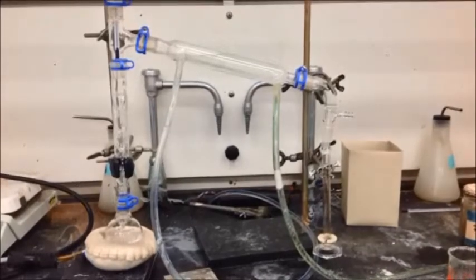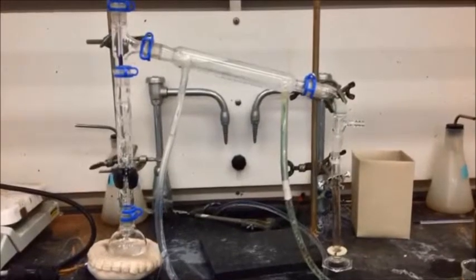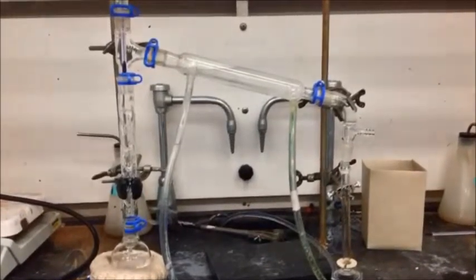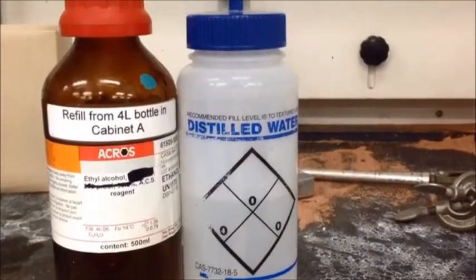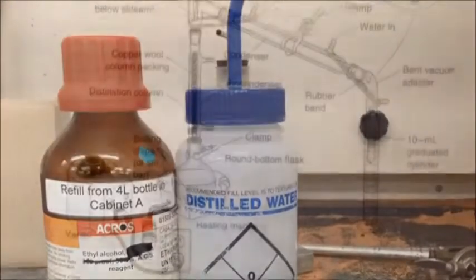Fractional distillation is a method of separation using boiling points. The substance that has the lower boiling point will be able to boil off and be collected, separate from the substance with the higher boiling point. Today we'll be using a mixture of water with a boiling point of 100 degrees Celsius and ethanol, which has a boiling point of about 78 degrees Celsius.